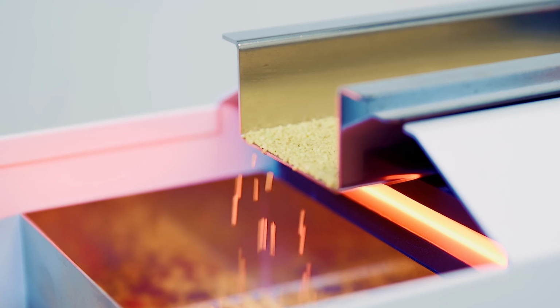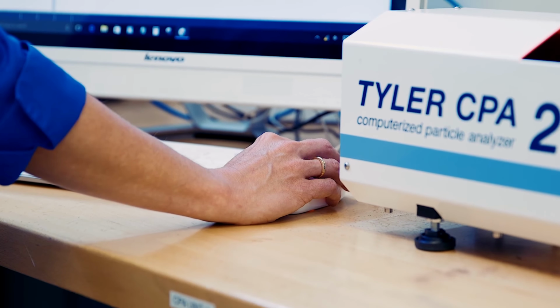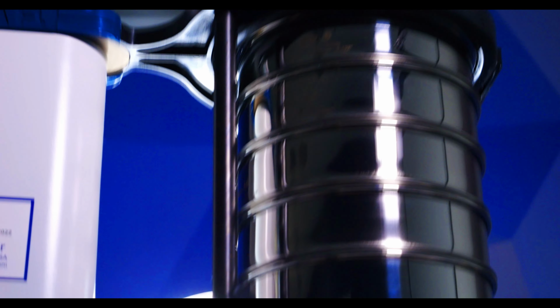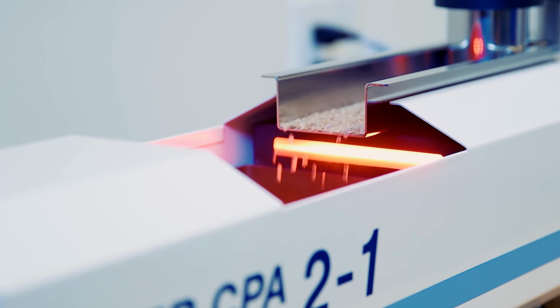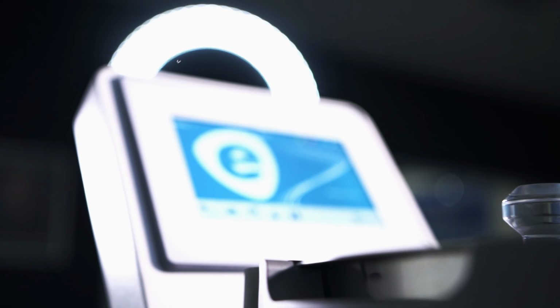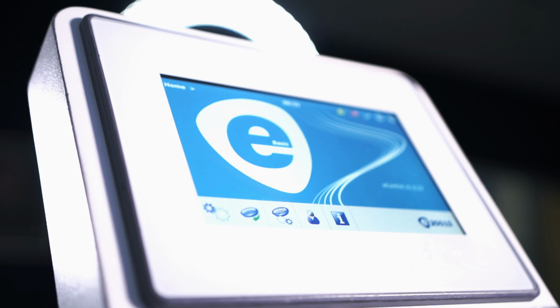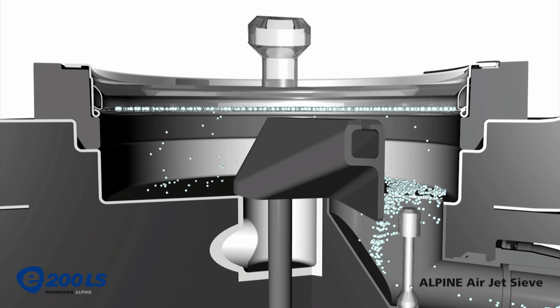General material information is critical to the process. This will allow the wire mesh supplier to make the necessary adjustments to ensure the best results. For example, if it's not very resistant to wear, we wouldn't want to use a Rotap sieve shaker to size the material because it could be pulverized. Or, if the material is not dry and free-flowing, we wouldn't want to use a dynamic image analysis system because you would get inconsistent test results from agglomerated particles. And if the material needs to be retained and returned after testing, we would want to avoid using an air-jet sieve, since the passing material would be lost, unless of course we're using a collection cyclone.